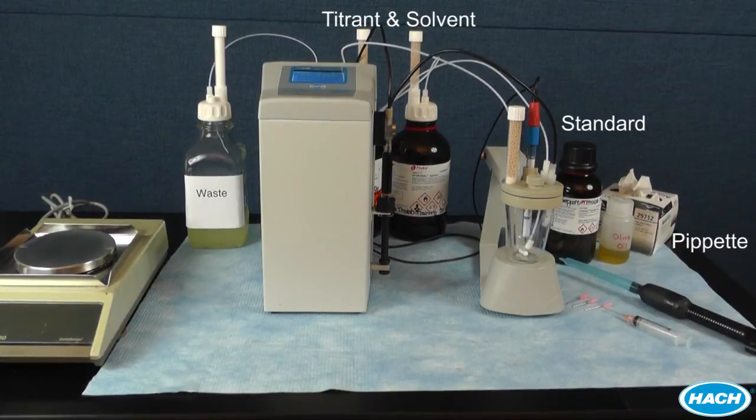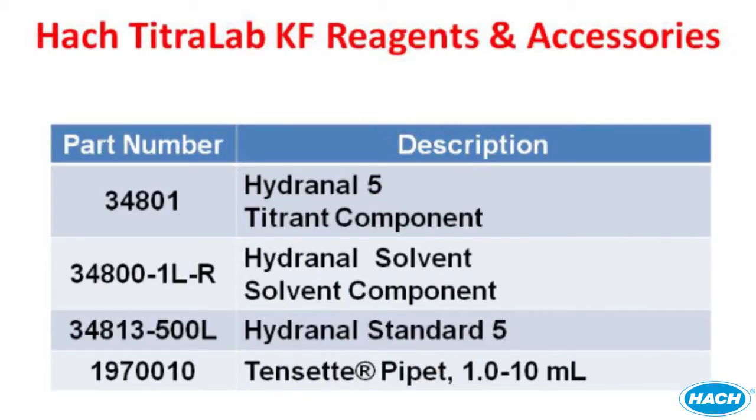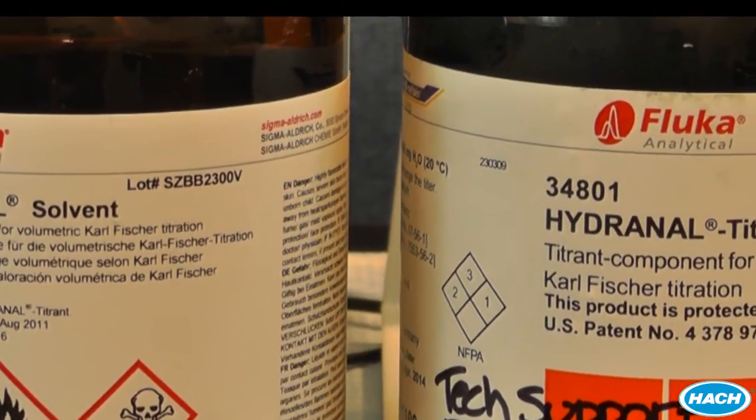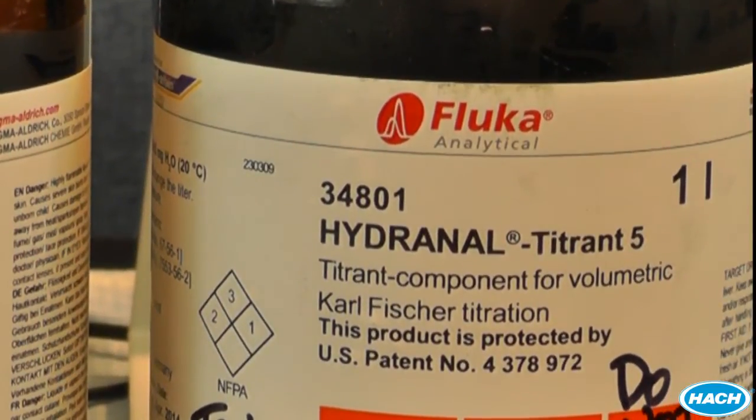This picture shows the entire system and labels the additional accessories that do not come standard with your instrument. Here is a list of those additional accessories with suggested part numbers. Some items, such as the concentration of titrant or type of solvent, may not apply to your particular analysis. If this is the case, you should alter the procedure to use the components that fit your application. For our demonstration, we are going to use a two-component solvent titrant system from Hydranal, which can be purchased from Sigma Aldrich. The titer of our titrant is the default 5 mg water per milliliter. Hach TitraLab is suitable for all Karl Fischer solvents and reagents, including both one and two component reagents. See the sections in your manual for more information regarding choice of titrant and solvent systems.